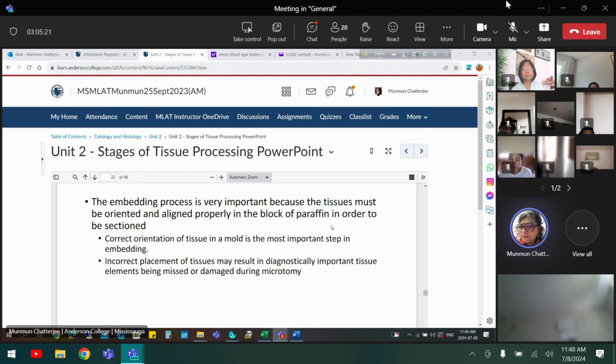So what is the dorsal side? What is the ventral side? How are you going to put in the tissue? Pathologists, or those who are working in the histopathology lab, have all the instructions on which tissue, and how to place the tissue. It depends on the sectioning, on how the tissues are going to appear in section.